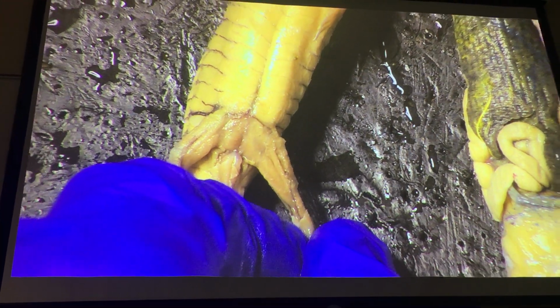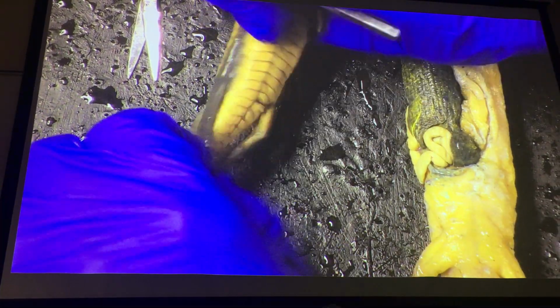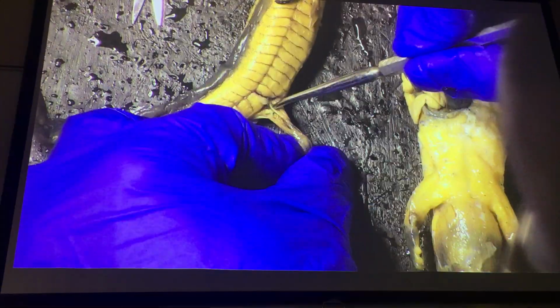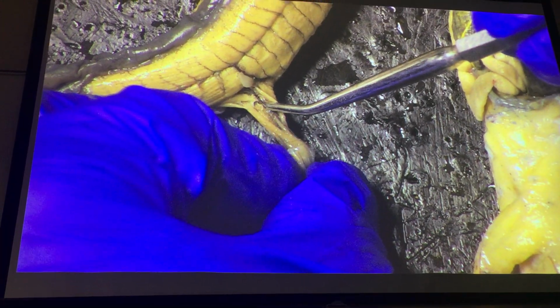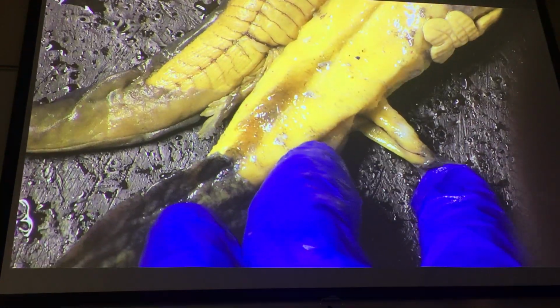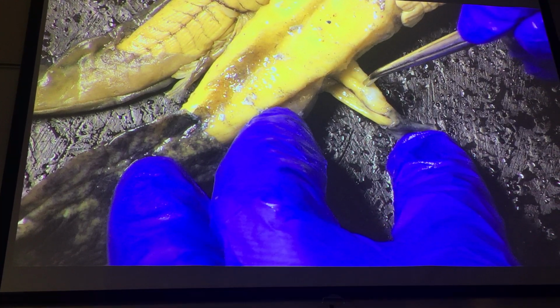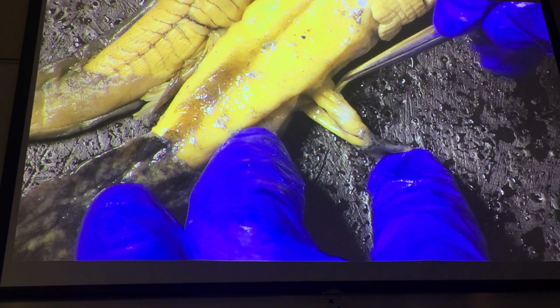Now we get to the area where a lot of people are having trouble. It's the back of the leg. All right? Looking at these little teeny ilio muscles here. Where do you start? This blood vessel is going to help you. Right? That blood vessel, on either animal. And even if you don't have the blood vessel, you've got a gap here between ventral and dorsal aspects of the thigh. So once you're above the blood vessel, there's your first ilio, second, and third.